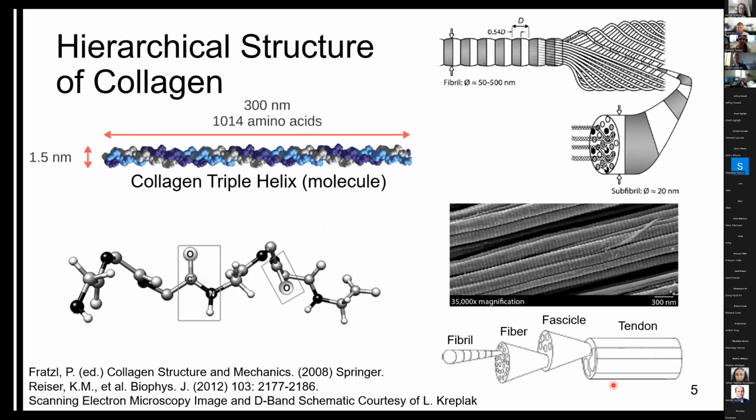So in biological structures, collagen type 1 molecules are 300 nanometers long, 1.5 nanometers in diameter, and they're these triple helical structures. And their SHG is believed to originate from the non-centrosymmetric arrangement of their amide bond, which is the likely dominant SHG emitter.